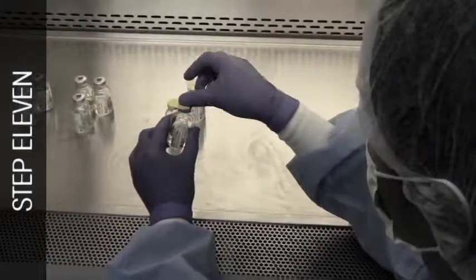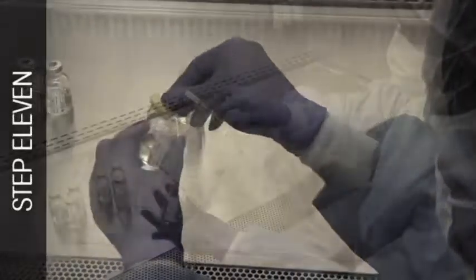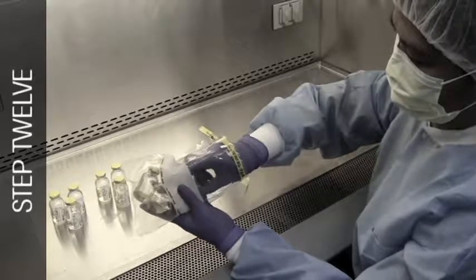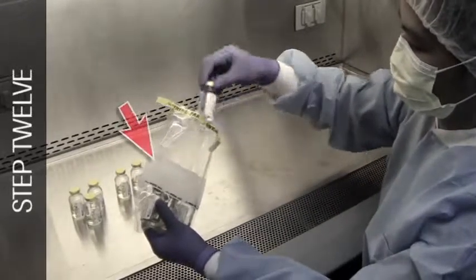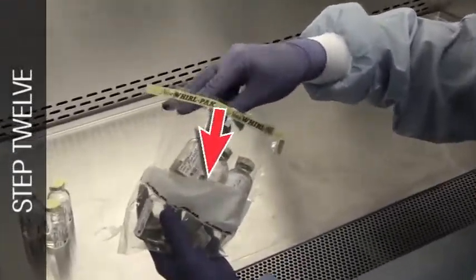Apply sterile adhesive seals aseptically to the rubber closures once the vials have been sealed. Carefully place the vials in the provided Whirlpack bag for transport to the incubator. A convenient write-on area on the bag may be used to identify the technician and the date of the test.